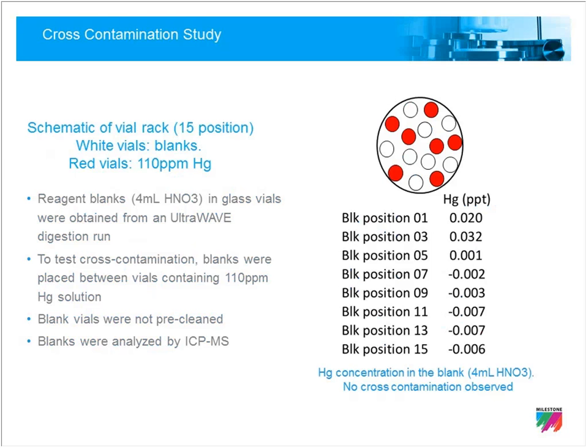Okay, so almost always the first question that we get asked when we talk about loose fitting covers and doing digestions at very high temperatures is, what about crossover contamination? Do you retain your volatile elements? And certainly it's the first question I asked when the technology was provided. So to test that, what we did was very simple.